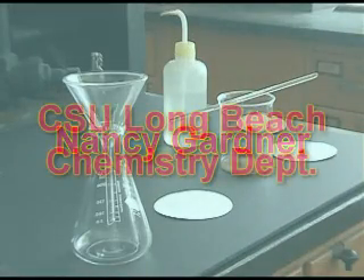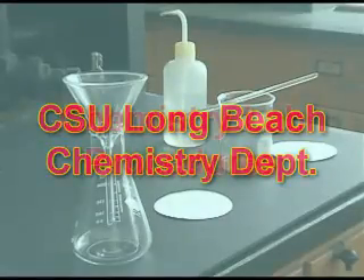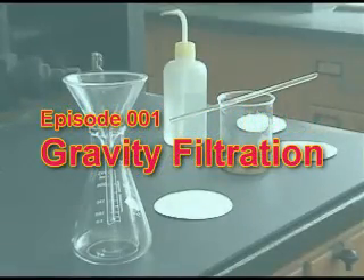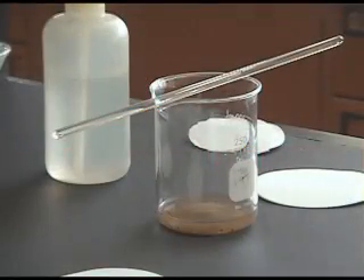Nancy Gardner of the California State University Long Beach Chemistry Department presents Chemistry Lab Procedures, Episode 1: Gravity Filtration. To separate solids from solution, we use gravity filtration.